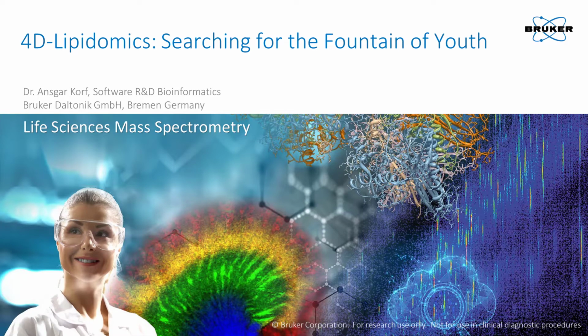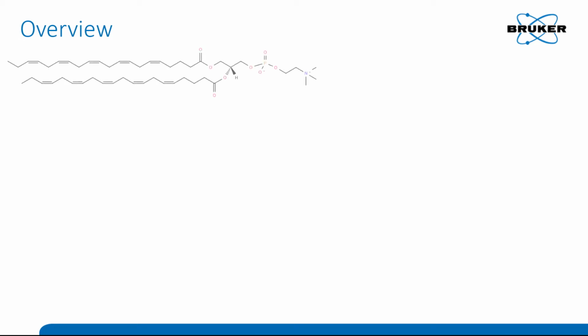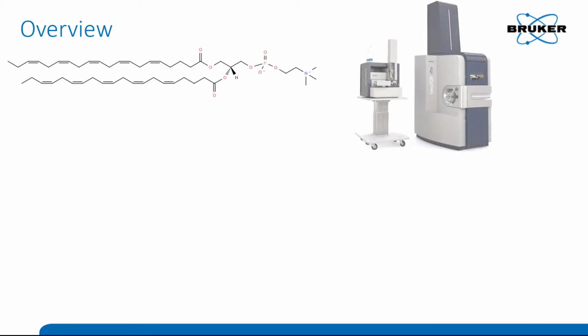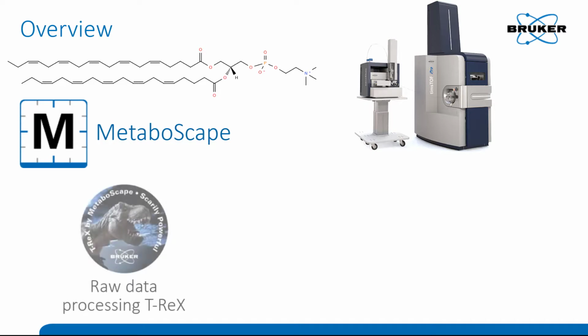In the following presentation, I'd like to give you an introduction to lipid identification workflows in liquid chromatography trapped ion mobility mass spectrometry datasets within MetaboScape. MetaboScape is Bruker's all-in-one non-target data processing software, which covers all steps from raw data processing to high-confidence compound identification. In the last release, we have focused on enabling high-confidence lipid annotations in accordance with Lipidomics Standard Initiative guidelines.